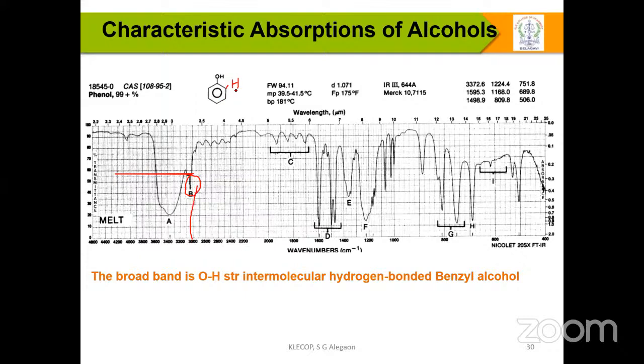Another one is the carbon-carbon double bond, which we can usually observe, three to four peaks, somewhere between 1400 and 1620 reciprocal centimeter. This is the assignable peak. In the fingerprint region, somewhere around 1400 and below, most peaks are unassigned; under standard conditions we get different bending and different stretching. These things we can only understand once we are perfect with the stretching characters.